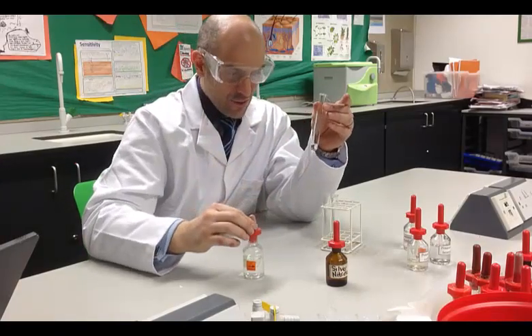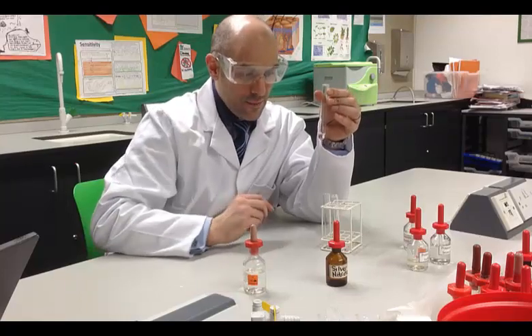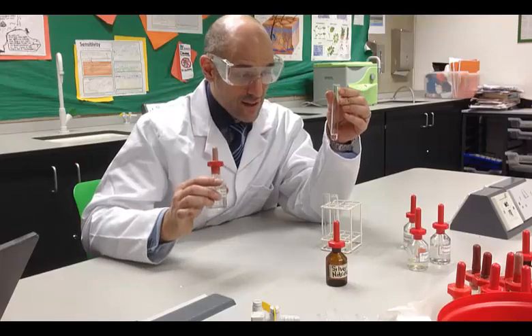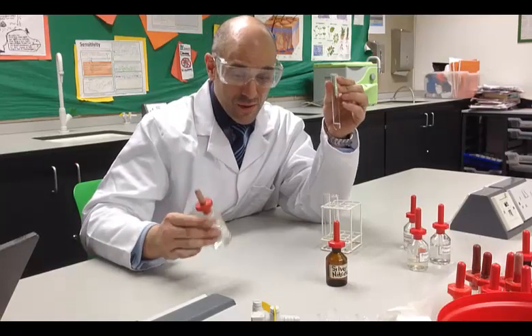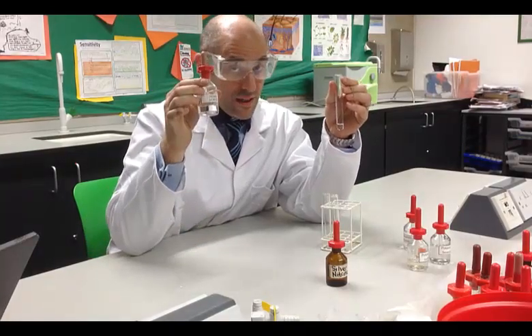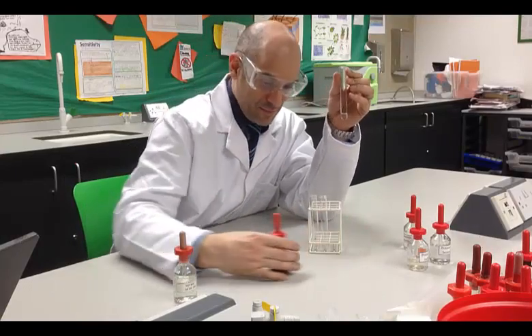An acid is added normally to these tests to remove any solid that you might have that could interfere with the test. We use nitric acid and we don't use hydrochloric acid because hydrochloric acid contains chloride ions and would interfere with the test. Nitric acid contains nitrate ions and hydrogen ions. It won't interfere with the test.